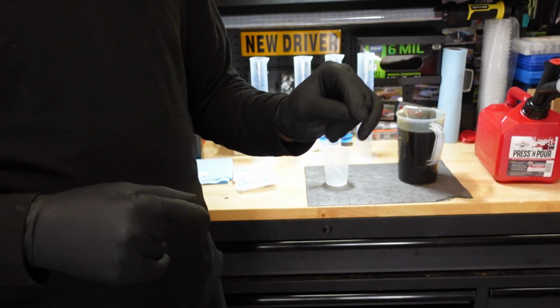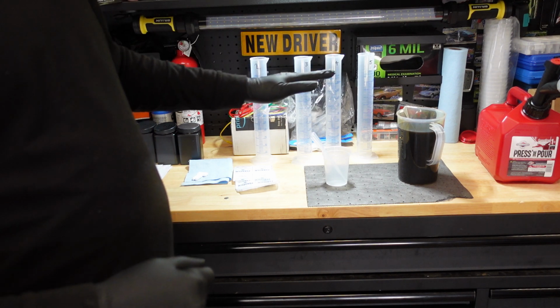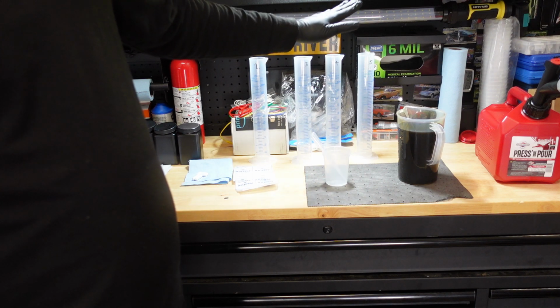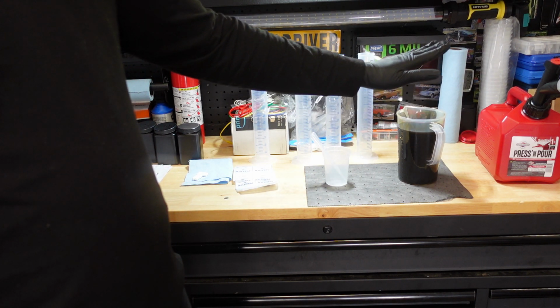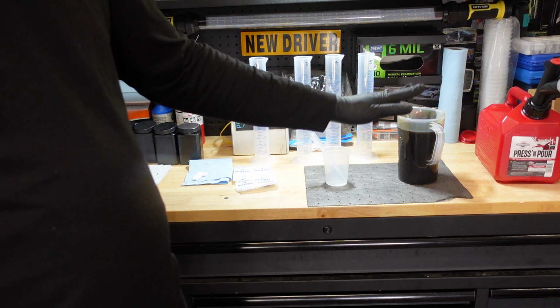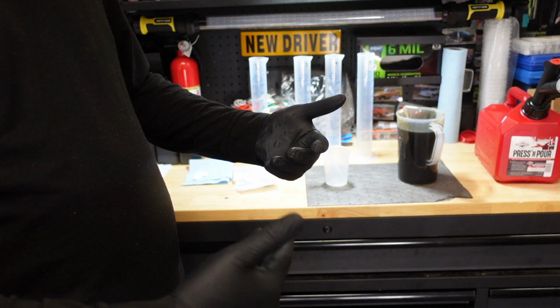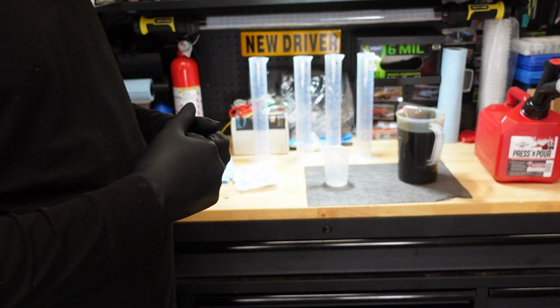I don't have a gold standard to compare Blackstone's fuel percentage against, but what I can do is submit multiple samples that have a known amount of gasoline inside the oil. Then, if they come back with accurate results, we can say that their results are accurate. And if they come back inaccurate, we can say that they're inaccurate.